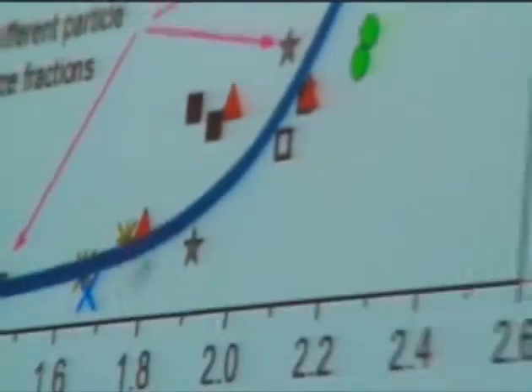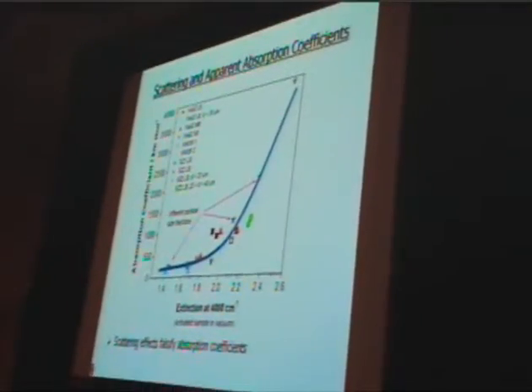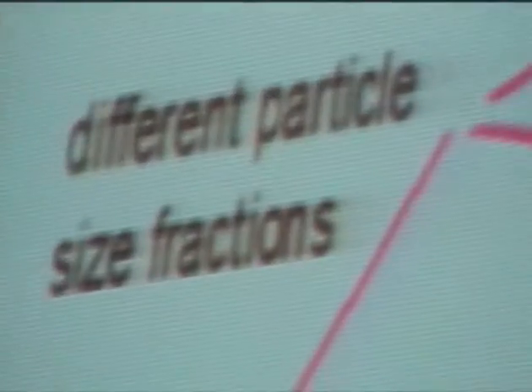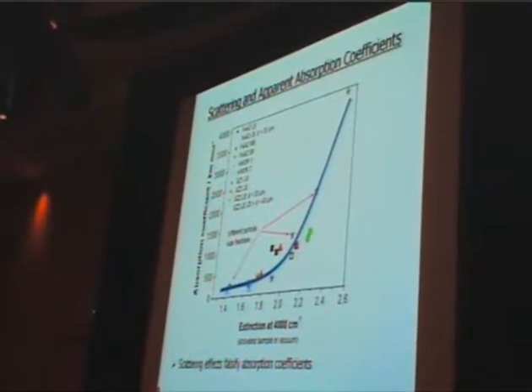Of course, the data points are not all on that curve because chemically these absorption coefficients should be different. But the main message here is that if we have strong scattering, the falsified absorption coefficients will be too large. One can analyze the shape of the curve, and then one sees that this is commensurate with the equation that describes scattering in wafers.